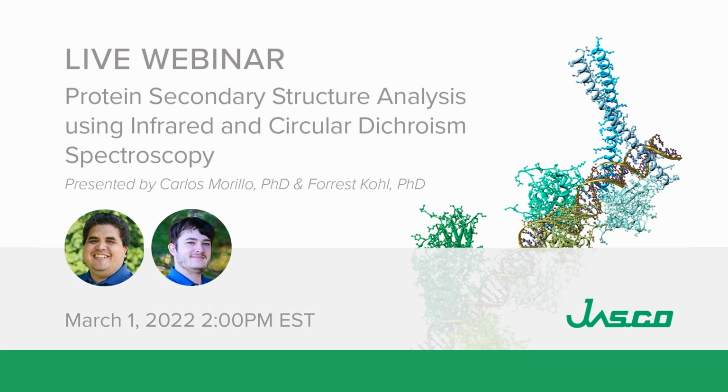Today it's the first of our webinars this year, and it's part of a series that we'll be doing throughout the year. In this particular webinar, we've got our two application specialists in vibrational and electronic spectroscopy, and they're going to be introducing both the use of IR spectroscopy and circular dichroism for protein structural analysis.